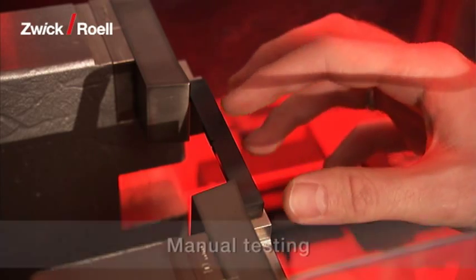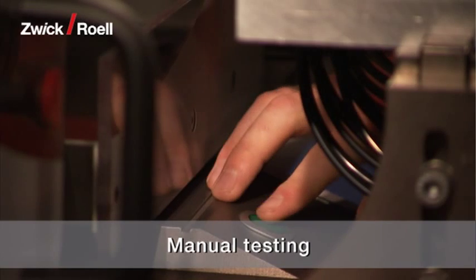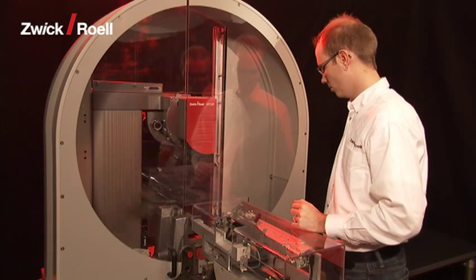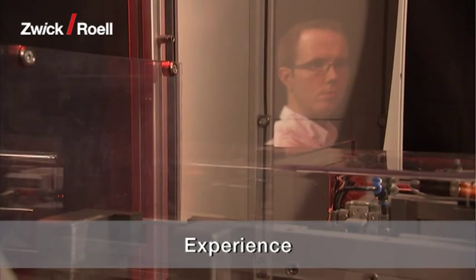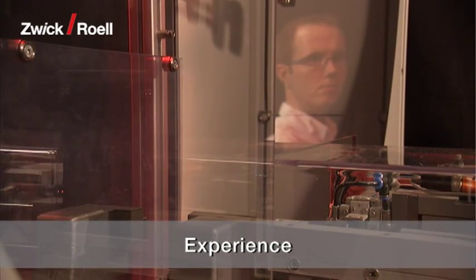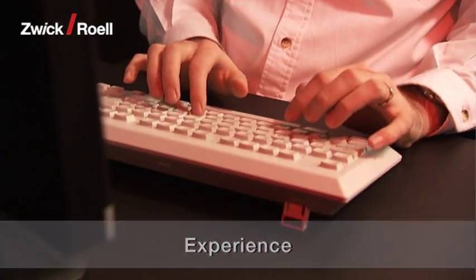The automatic testing system shown here can also be used for manual tests whenever required. Zwick's knowledge and experience has been gained over 25 years and from supplying more than 350 robotic testing systems worldwide.